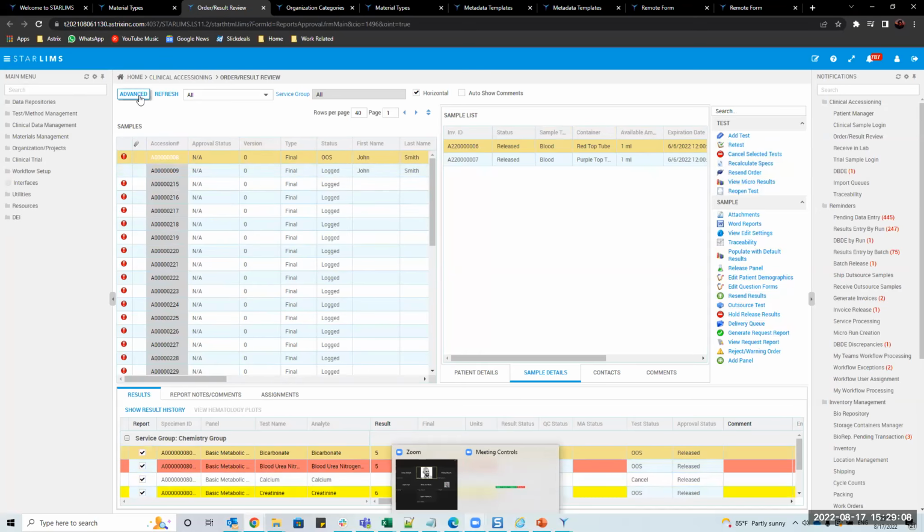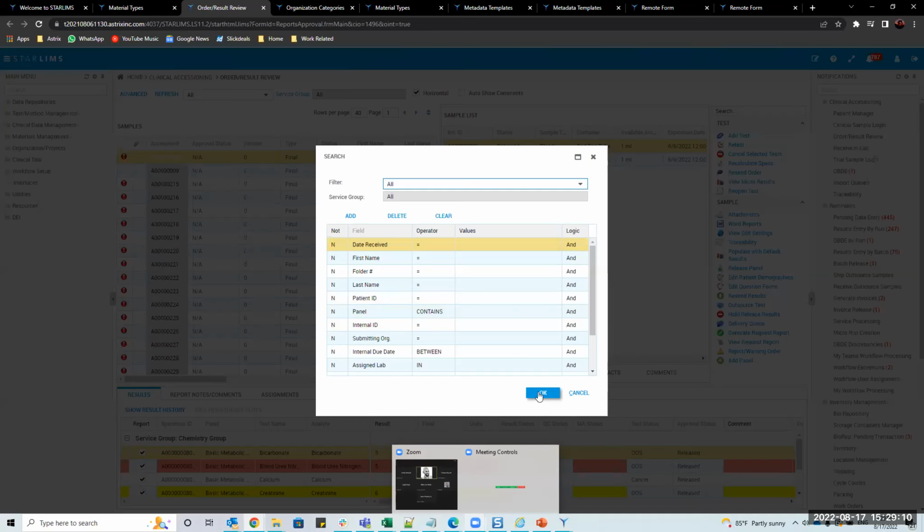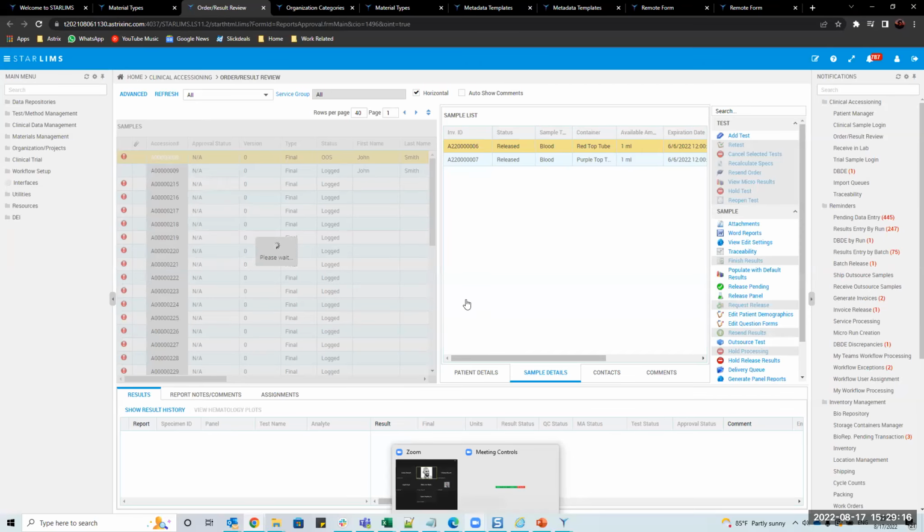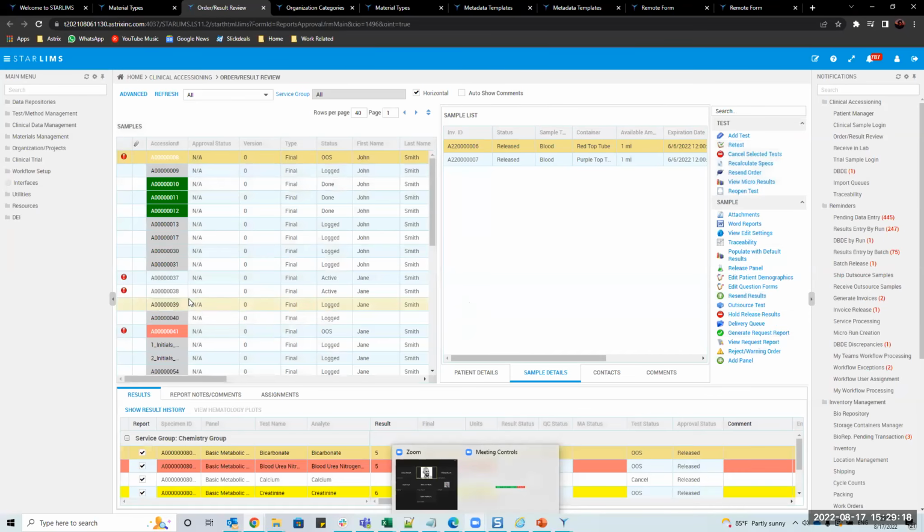In the old system, you would hit OK, and then nothing happens, nothing's happening, still nothing's happening, and then boom, everything just at once. At least with this one, you get little pieces that start loading, and other things that are waiting, which gives a better sense of UI and UX for a user.